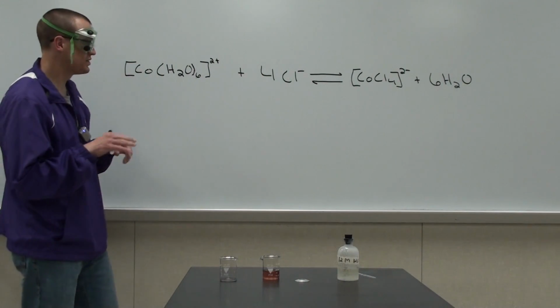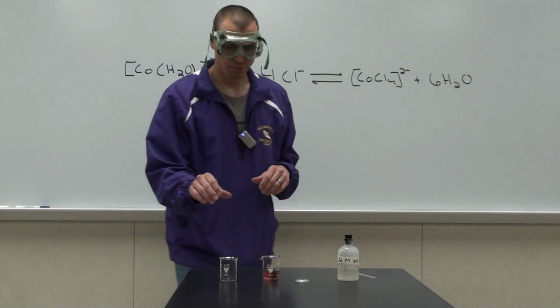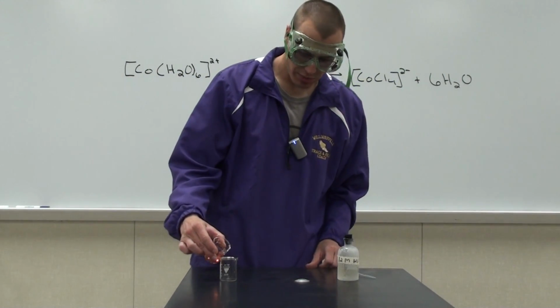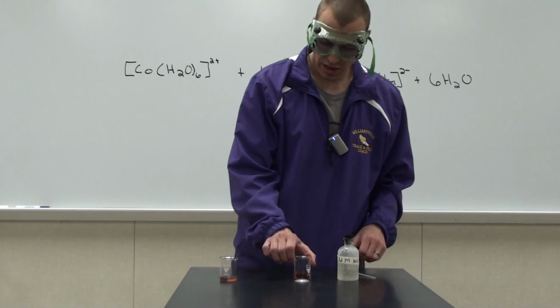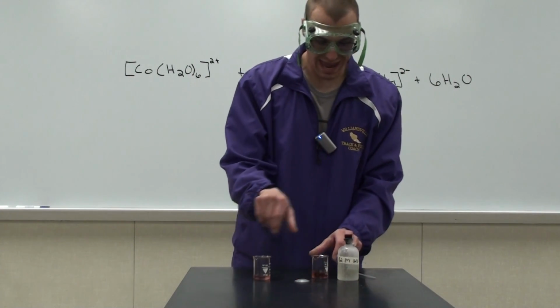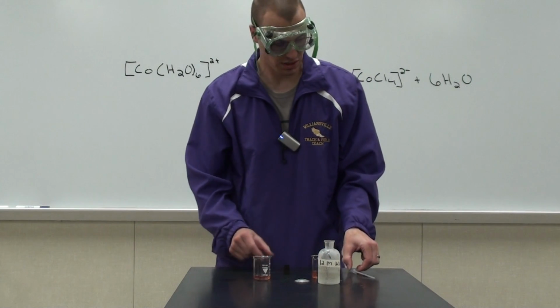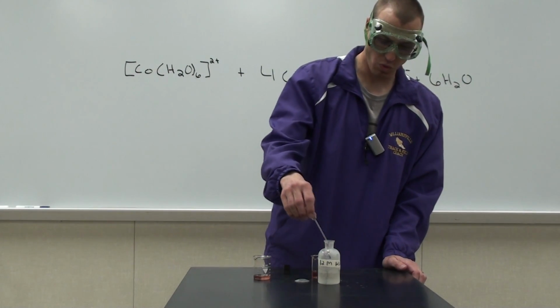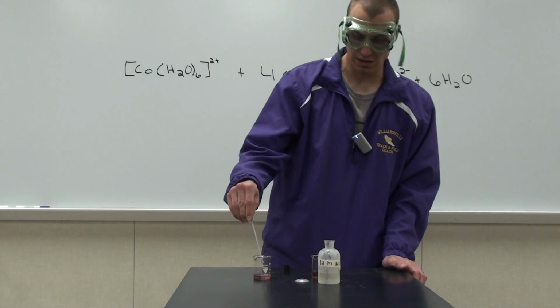So let's go ahead and see this demonstration in action. Like I said, I'm just going to take a little bit of the original cobalt complex here, and then I'm going to add some concentrated hydrochloric acid to this solution. And I'm going to wait and see for a distinct color change.